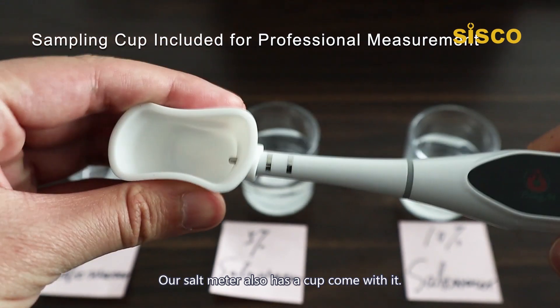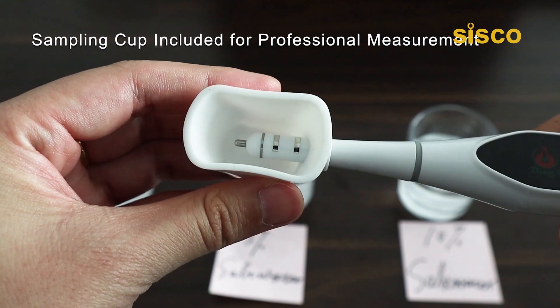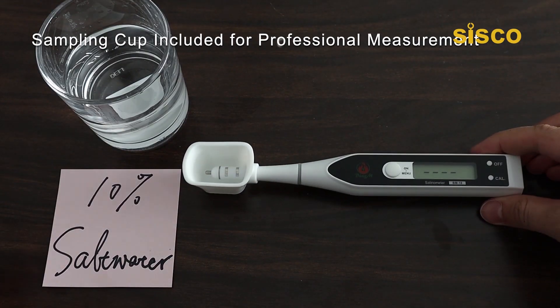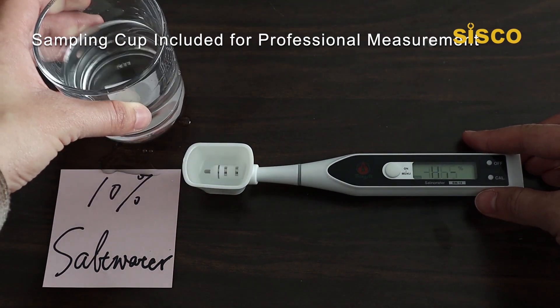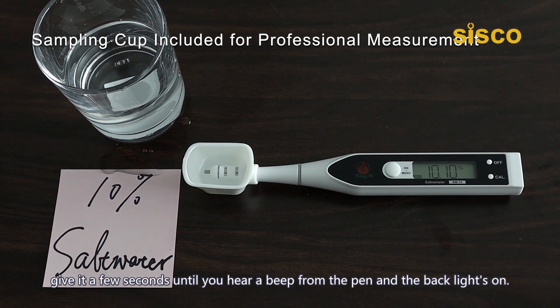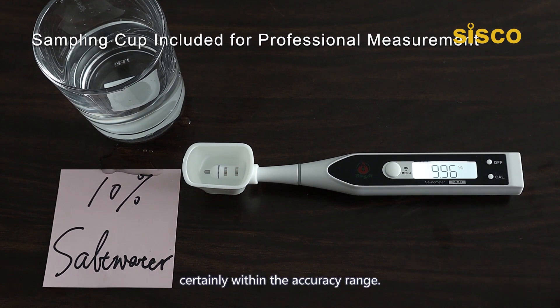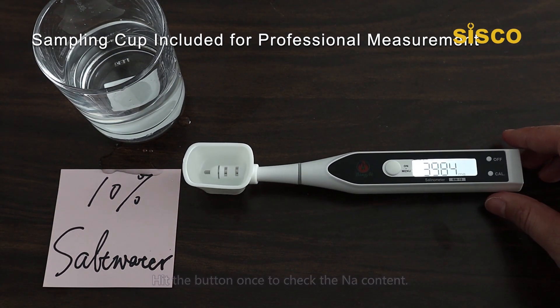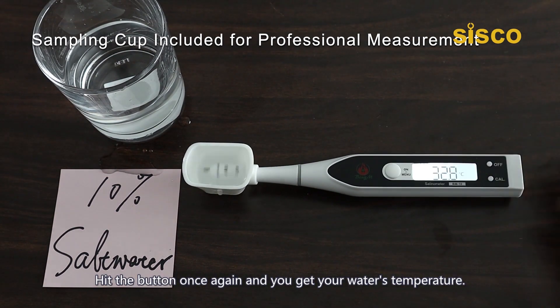Our salt meter also comes with a cup. Simply attach the included silicone cup to the pen. Turn the meter on and pour some salt water into the cup. Give it a few seconds until you hear a beep and the backlight turns on. It reads 9.96%, certainly within the accuracy range. Hit the button once to check the sodium content, and hit it once again to get your water's temperature.